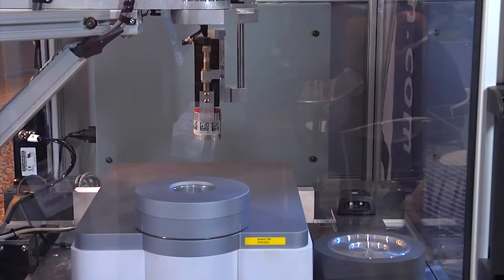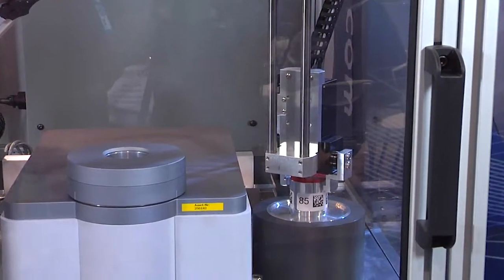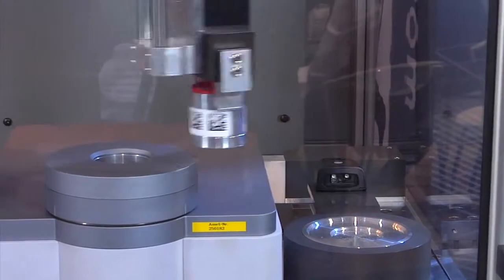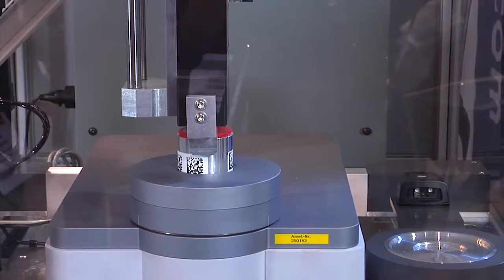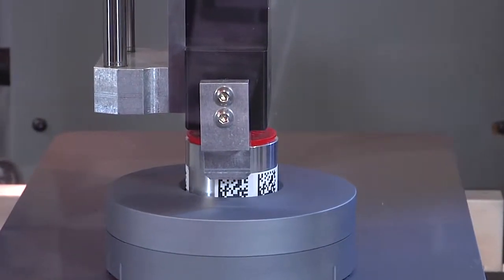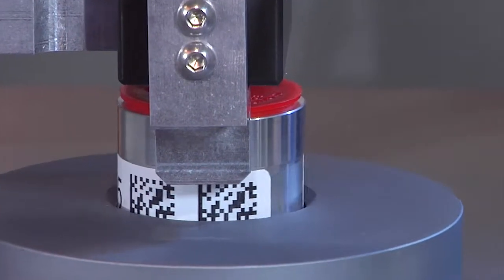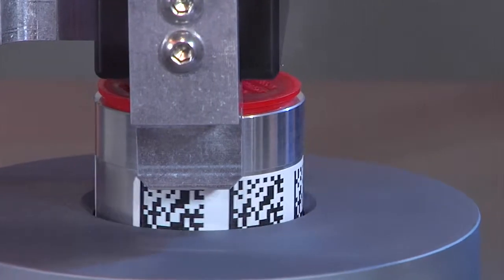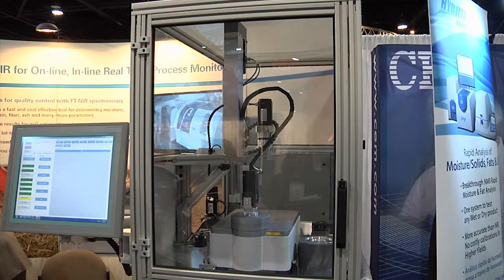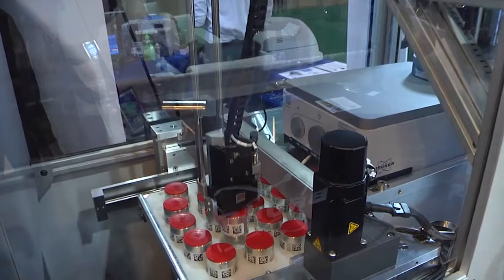When a sample cup is picked up by the delivery arm, it is first placed on the internal barcode reader. A query of the sample registration database identifies the sample cup by its barcode, then reads the identity of the sample in the cup from the database. The sample cup is then placed on the spectrometer for measurement. The results of the sample measurement are logged in a separate SQL database for later use in formulation software or determination of supplier-dependent variation. The sample cup is returned to its position on the tray at the conclusion of the measurement.